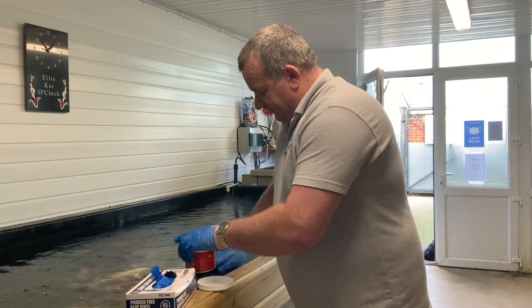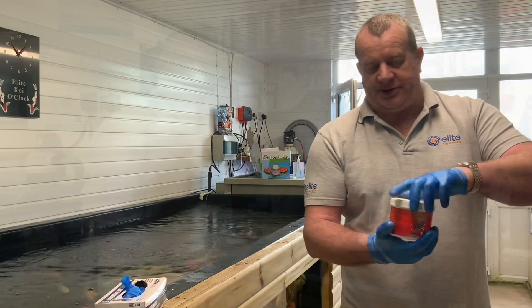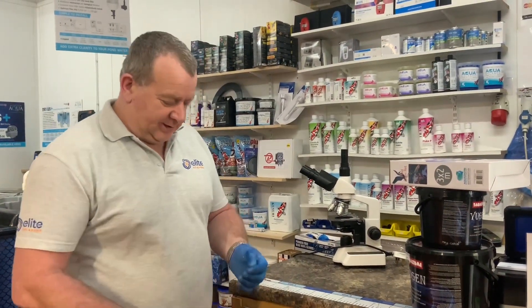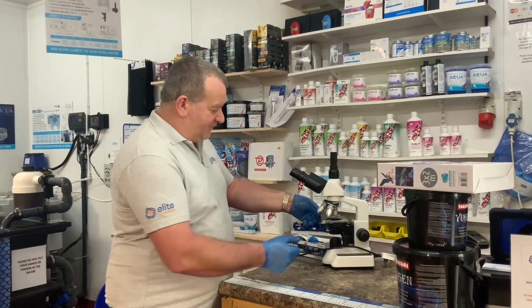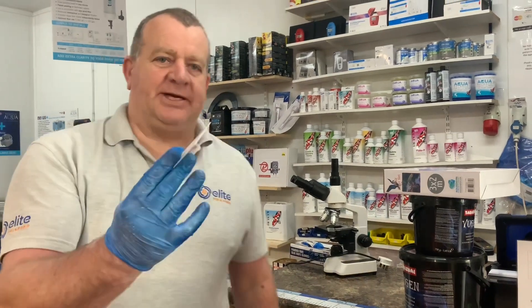We'll wait for the customer to arrive and then we'll go and get a sample of mucus from his koi. Will's come in to have a couple of fish scraped this morning. We've got a clean slide and a clean slip positioned on the microscope so we know where they are. I'm going to use a plastic card to get the sample, so we'll go and get a sample.